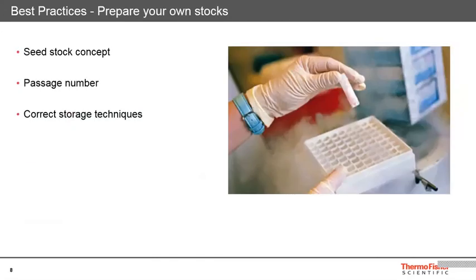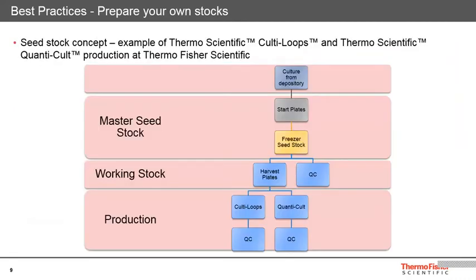Best practices for preparing your own stocks of QC organisms. In this, we'll discuss the seed stock concept, passage number, and storage techniques. Seed stock or seed lot technique. All regulatory bodies advise to maintain cultures of QC organisms through the seed stock method. I'll try to explain this concept through the example of production of Culti-Loops QC organisms from THERMOFISHER.